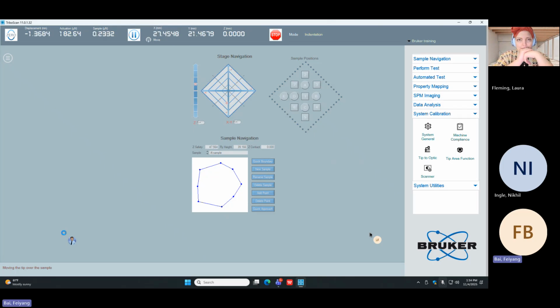Do you guys have a standard one? Not for the TS77 and not really generally. It's so dependent upon users and the facilities. I have some instruments where one man has been running that instrument for 20 years straight. No one else has touched it besides me when I come on site, versus systems in a shared use facility where 20 different people can be on it in a day.